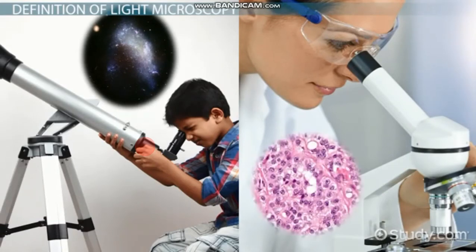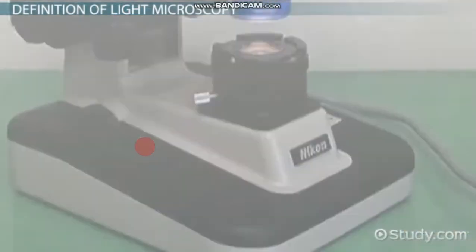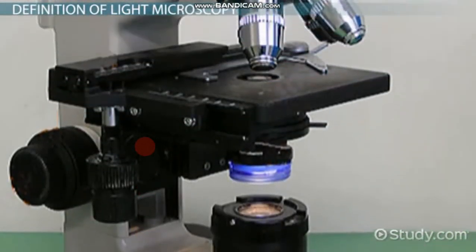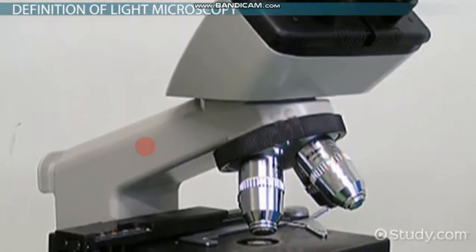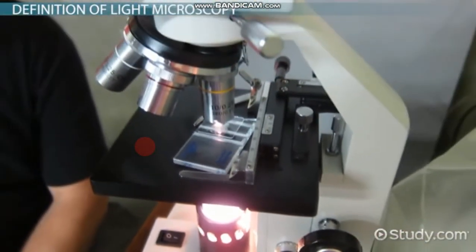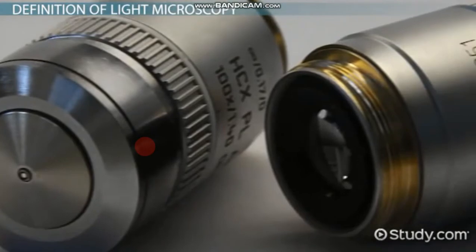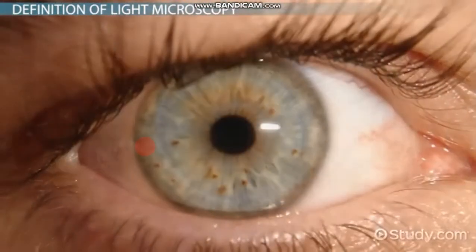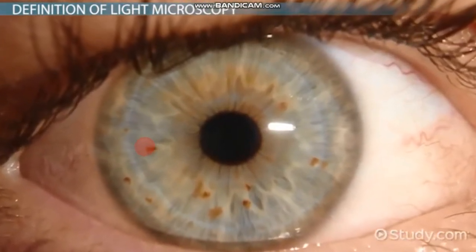Light microscopes send light through a path that first focuses the light into a tight beam and then passes that light through a sample, which creates an image. That image then passes through one or more lenses to magnify it until it reaches the user's eye or a camera.